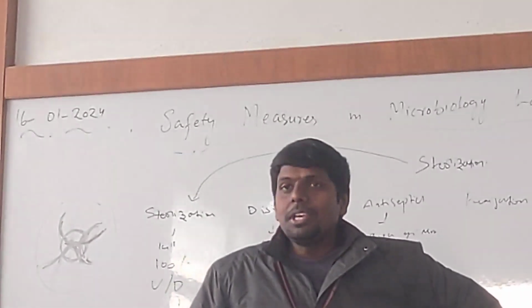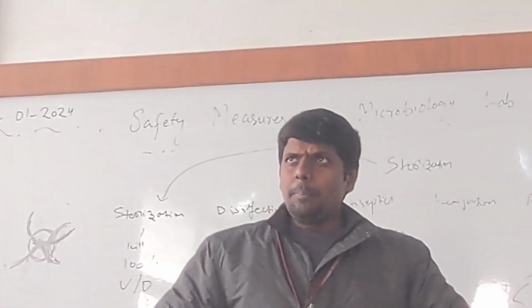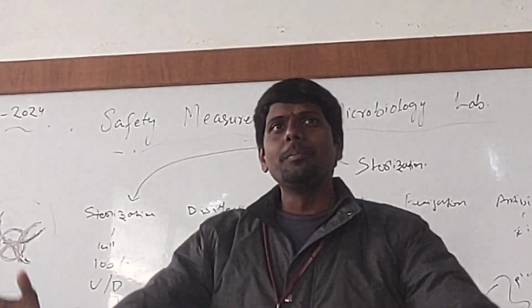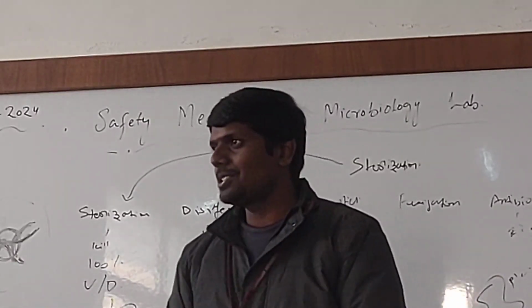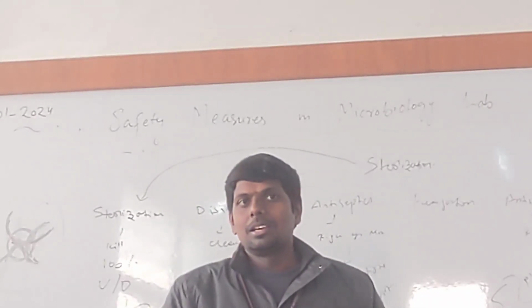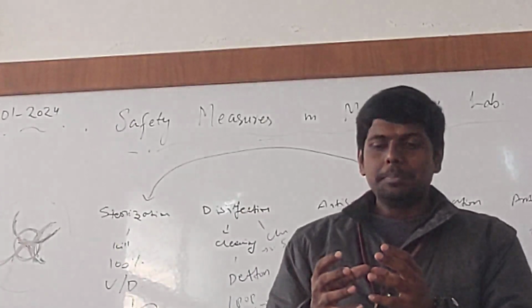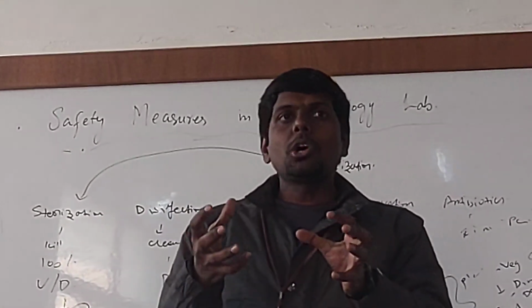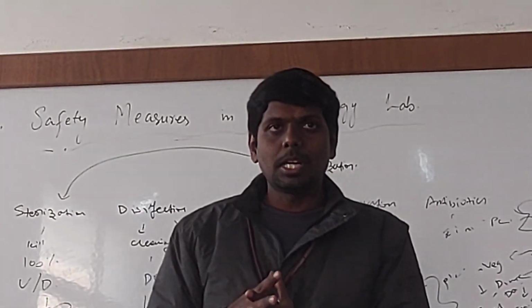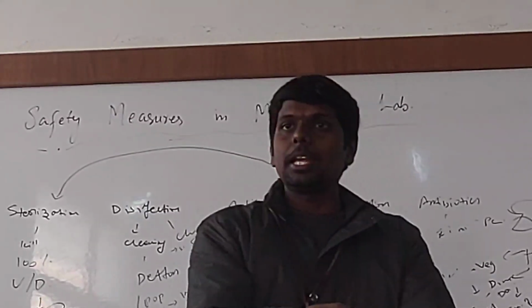And that is where we have different approaches. Is it possible to sterilize this entire room? The whole room should be sterilized. Is it possible? No, sir. Not possible, right? Now what we will do is make very toxic fumes, such as formaldehyde. Formaldehyde is a gas, so we will set up a reaction.